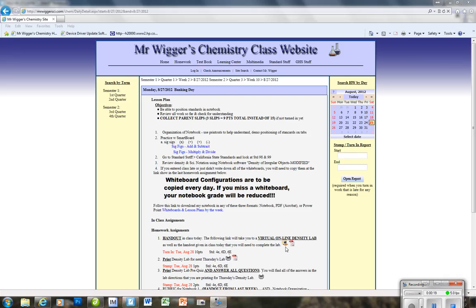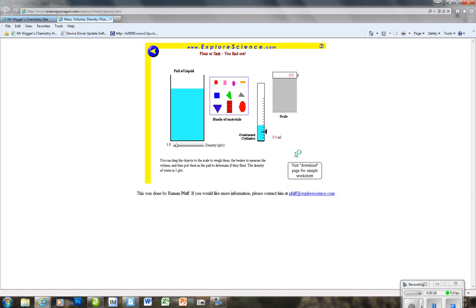We're already there and we're going to click on this icon right here. If you look on the screen you can see it, and you click that and that will take you to the virtual online lab.